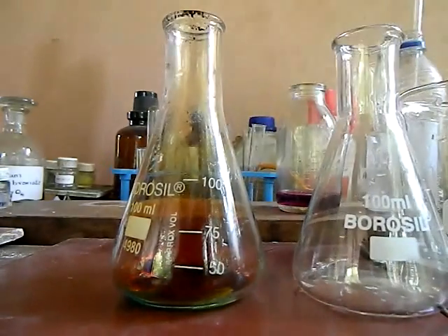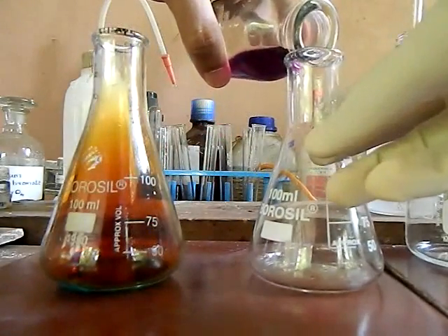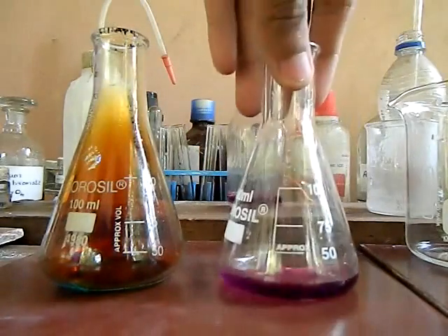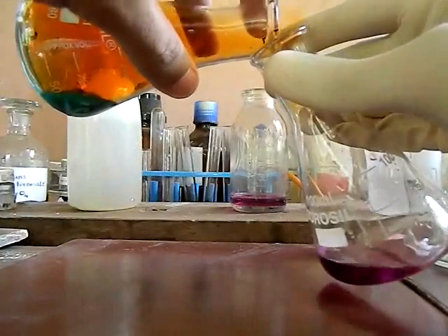Now we take another conical flask and pour potassium permanganate solution. As you know, the solution is pink in color. Then we pour the nitrogen dioxide gas in. Nitrogen dioxide gas is denser than air, so it flows down like water.